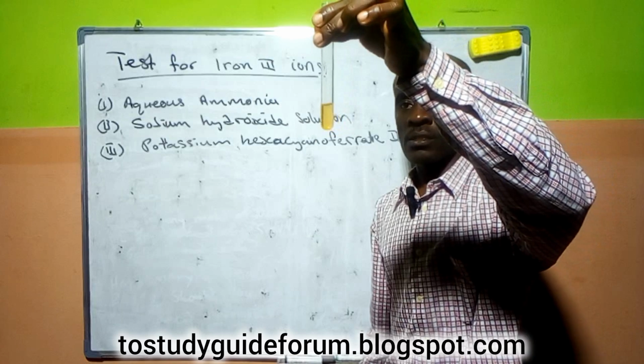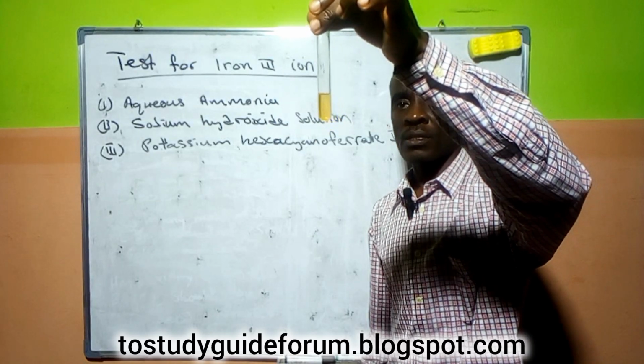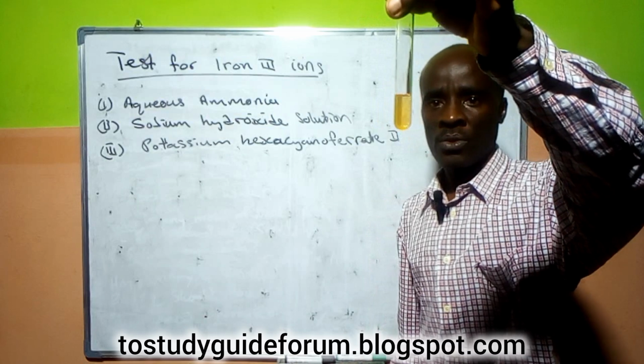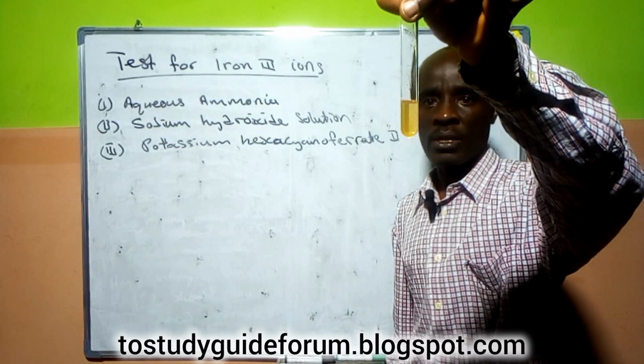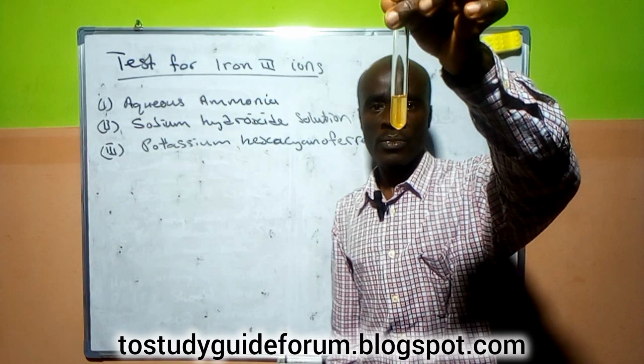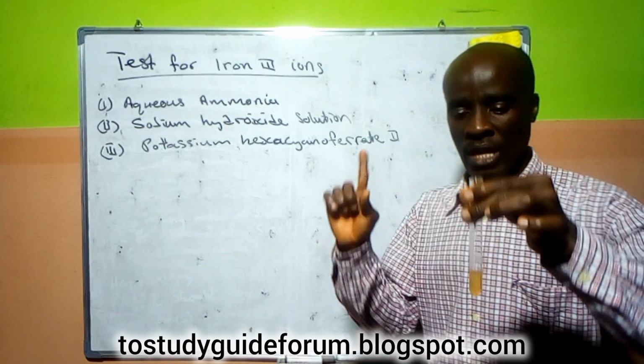The precipitate is forming. You can see the precipitate is insoluble. It's trying to settle. It's insoluble in excess sodium hydroxide solution. That's another method.